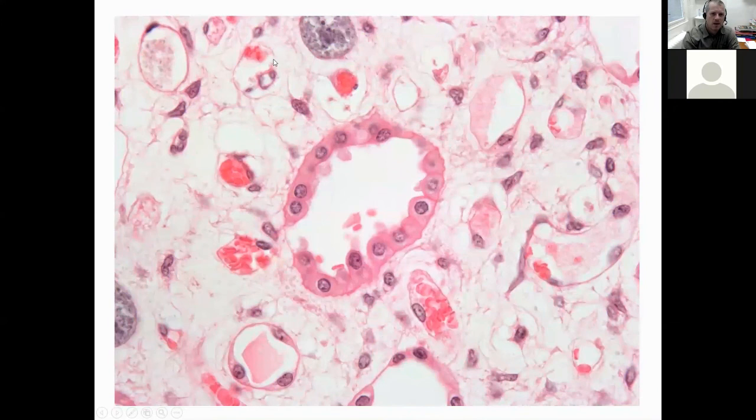And this is from the medulla of the kidney. These are the papillary ducts that take the urine to the tips of the renal pyramids, where the urine is dropping into the minor calyces of the kidney. But I am showing this to demonstrate the difference between a capillary here with the endothelium cell and the red blood cells, and this structure, which is not a capillary, but it's lined with simple squamous epithelium, and it's the thin segment of the loop of Henle. If you remember the loop of Henle in the renal medulla, that's it. The endothelial nucleus is much more bulging inside the lumen of a capillary. But otherwise, these are all similar structures. Again, capillaries of the renal medulla.